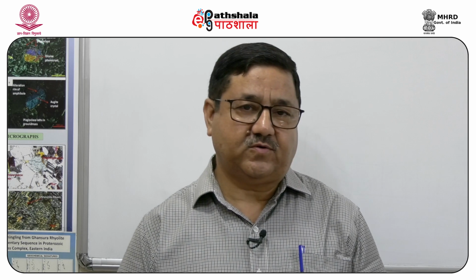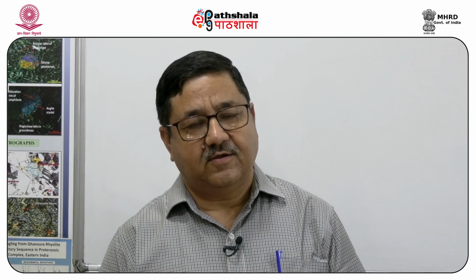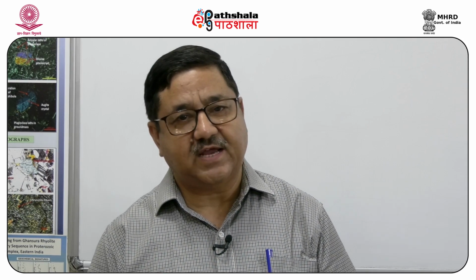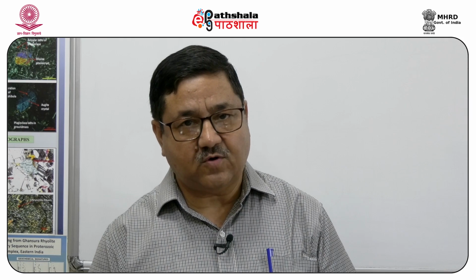Why we use a microscope is essentially to characterize geological material. When we characterize a geological material, by that I mean that we try to differentiate the heterogeneities of that material. It can be done using a normal polarizing optical microscope.